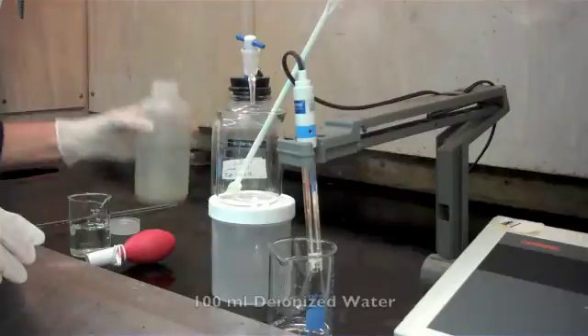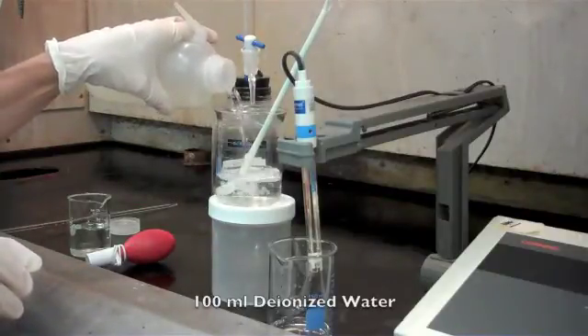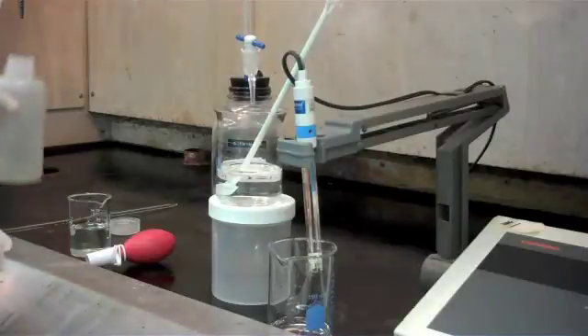Next we're going to add approximately 100 ml of DI water. The reason for the water is we want to make sure that our pH probe is completely submerged.